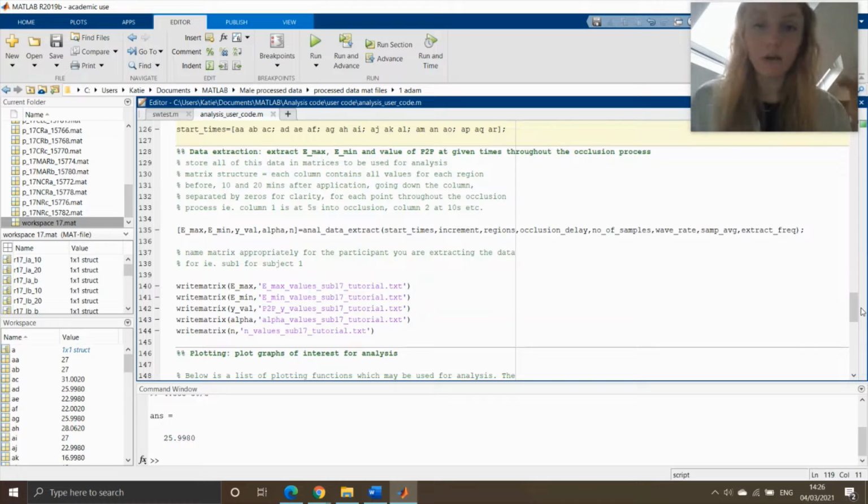You'll notice that there is a max value, the top of that peak, and a minimum value. Those two together will form your peak to peak, the amplitude of the impulse function, and that's your processed waveform that the Fourier transform is carried out on using your baseline, your reference. That's the waveform that you're interested in. That's where you're going to get all that data from.